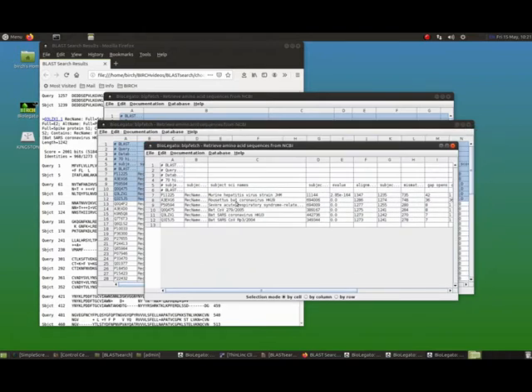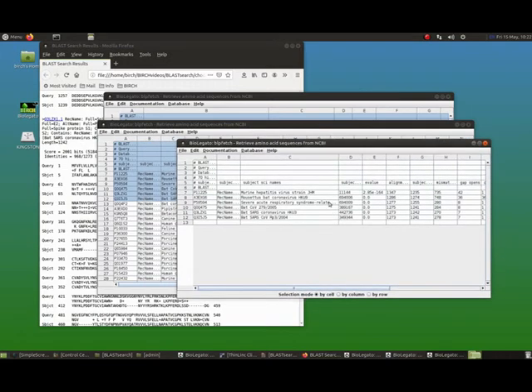You'll note here, by the way, that we've gotten an interesting zoo of sequences. We've got a bat sequence, and I guess a human one, maybe 4 bat sequences, and then the murine hepatitis sequence. So we've got an interesting mix of sequences, and we'll use that in our next steps.